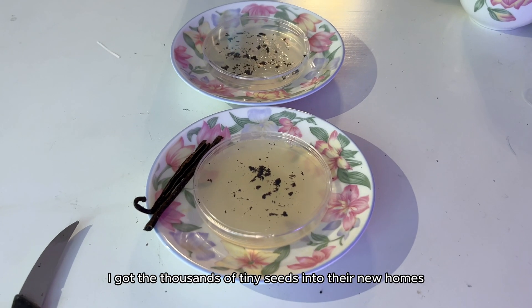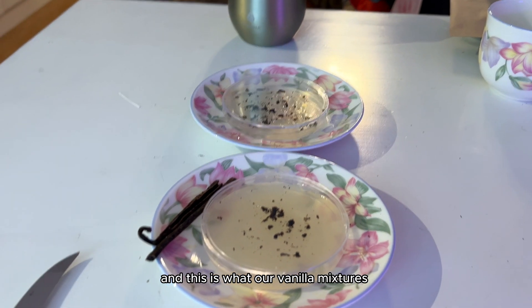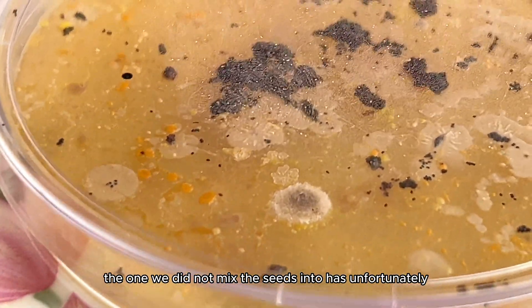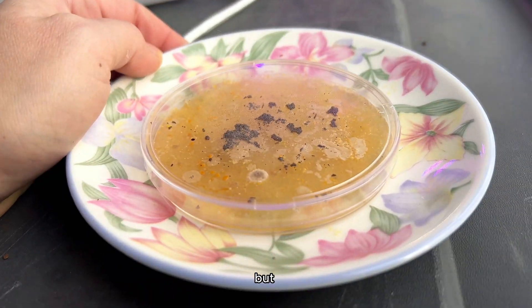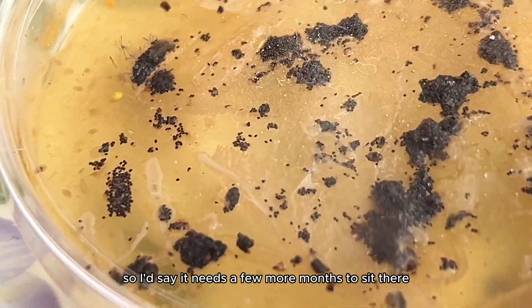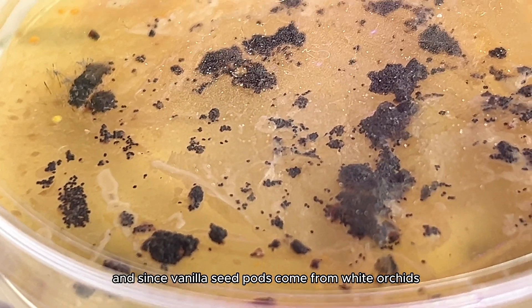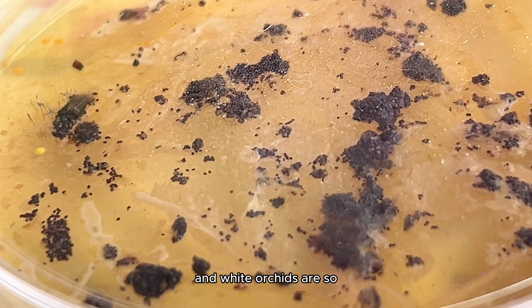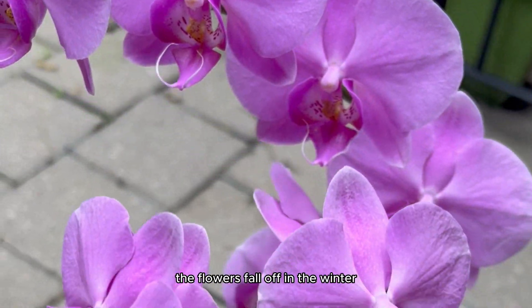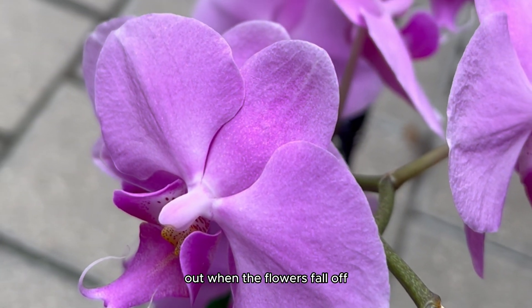After what felt like eternity, I got the thousands of tiny seeds into their new homes. Currently, it's been about four weeks, and this is what our vanilla mixtures currently look like. The one we did not mix the seeds into has unfortunately molded over, but the one that we did push the seeds into looks promising, and there is no mold. I'd say it needs a few more months to sit there and micropropagate until we can transfer it into its next home. And since vanilla seed pods come from white orchids, and white orchids are so difficult to keep alive, a lot of people actually don't know that orchids are seasonal bloomers — the flowers fall off in the winter, but they grow back in the summer.